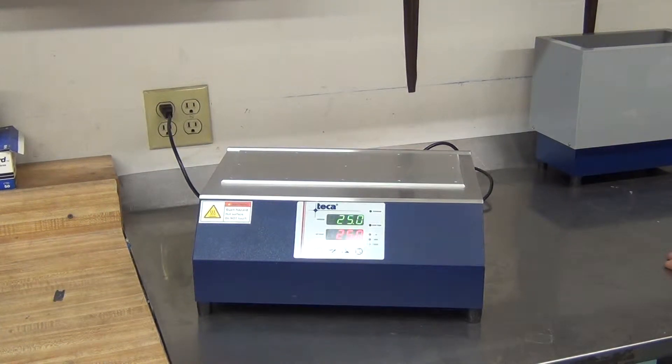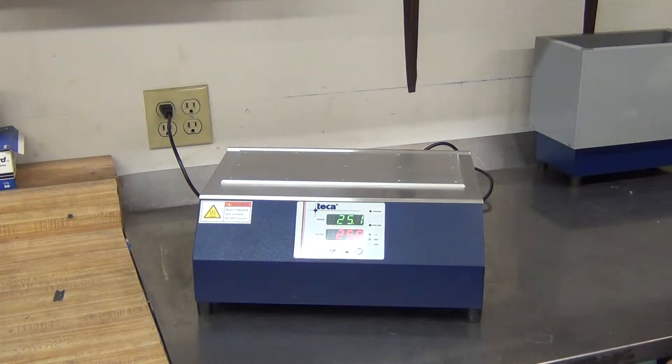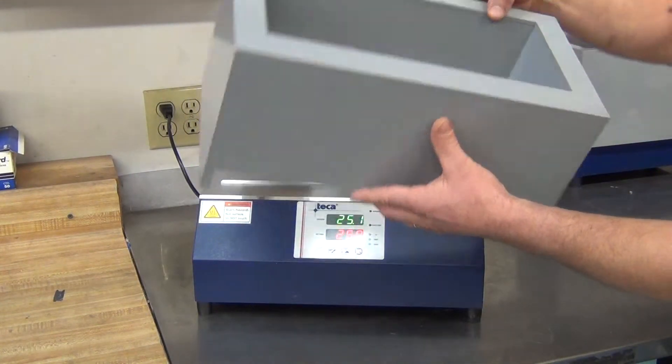Welcome to Tekka Labs, where we make cool things. Today I'm going to show you an accessory for our AHP 1200 CPV line. Here shown is a tab version. The accessory is the ICE 1200, an electric ice bucket that's temperature controlled.